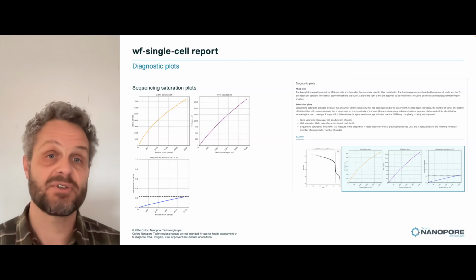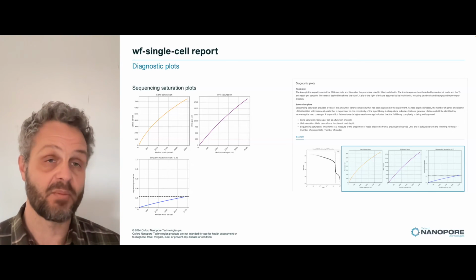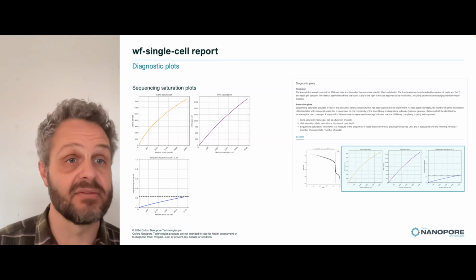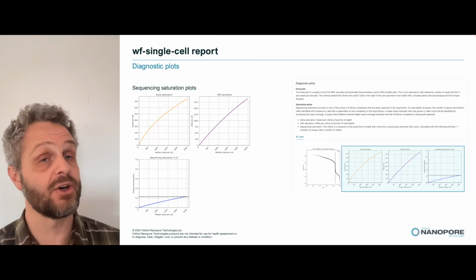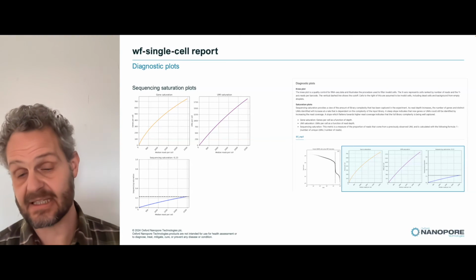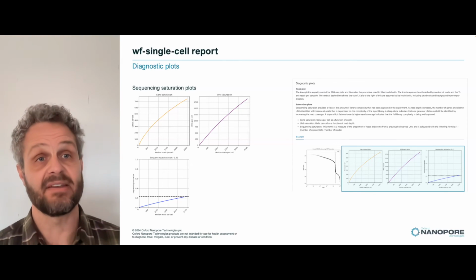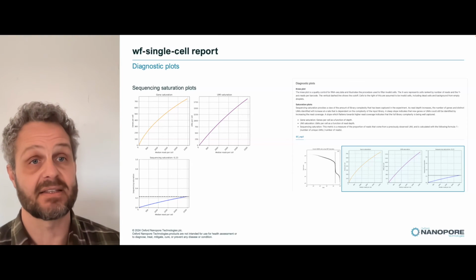So if we'd captured much of the gene complexity of the cell, we'd expect the curve to flatten out as the median reads per cell increases. And in this case, we don't see that. So what that tells you is that if we got more sequencing data from this experiment, we'd likely find more genes, and the same with the UMIs as well.